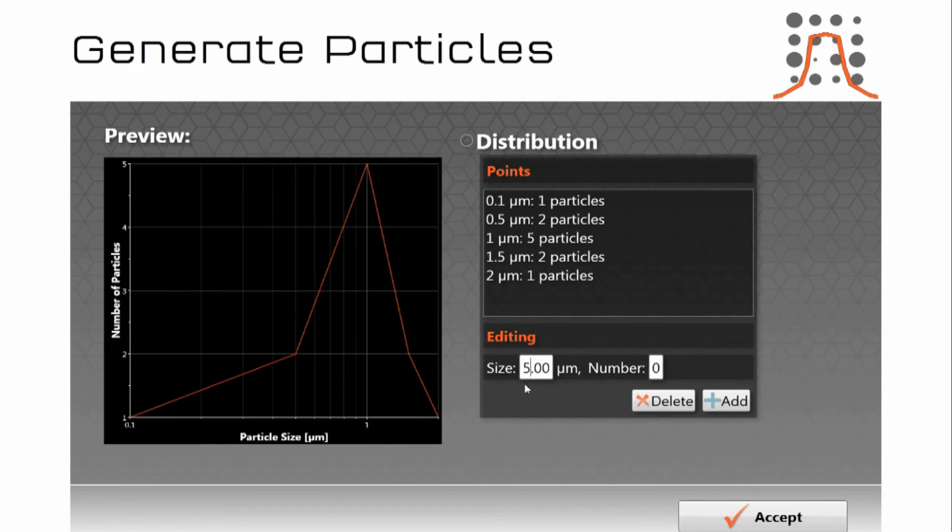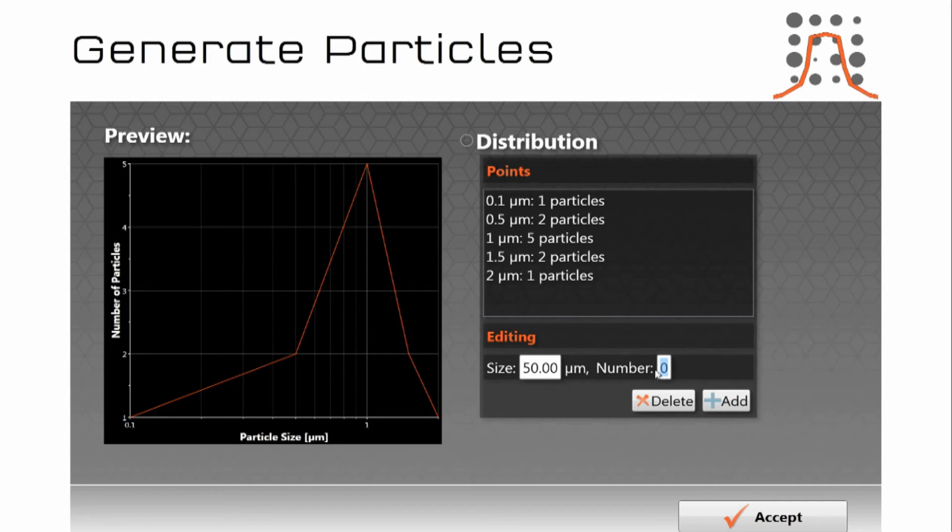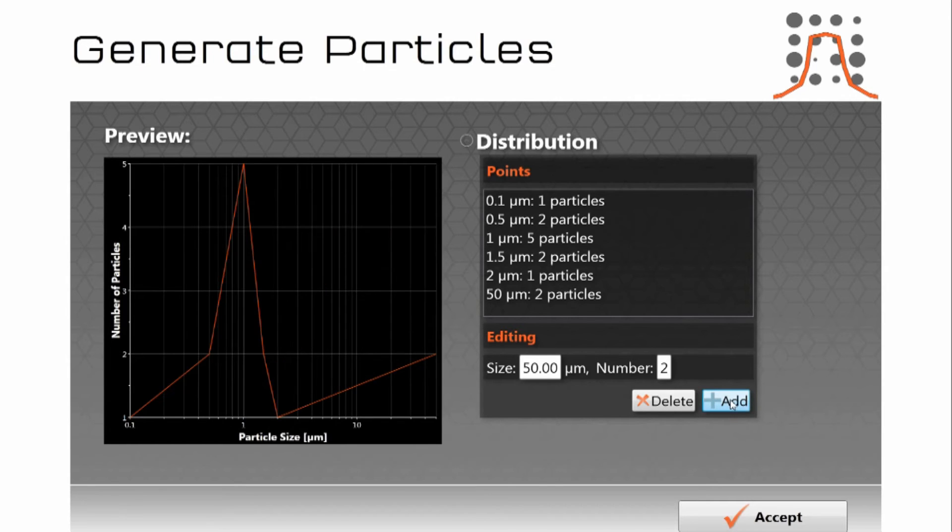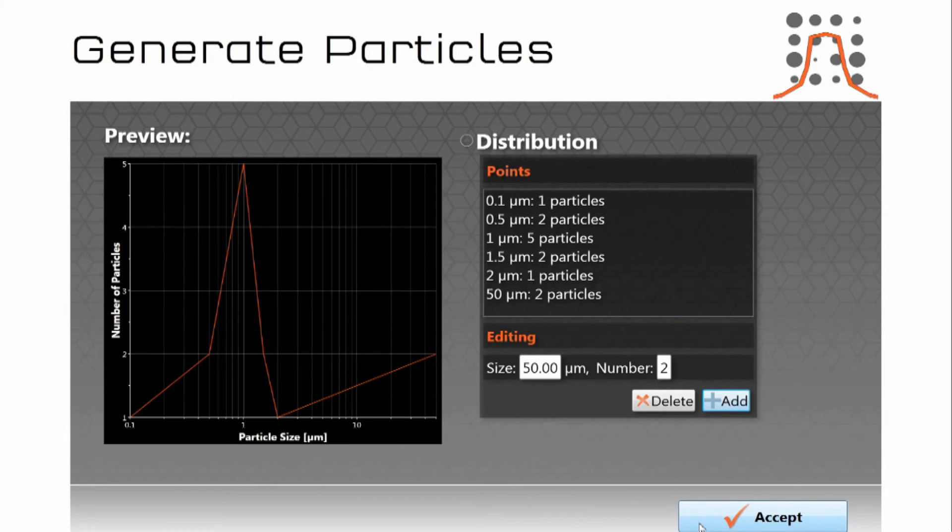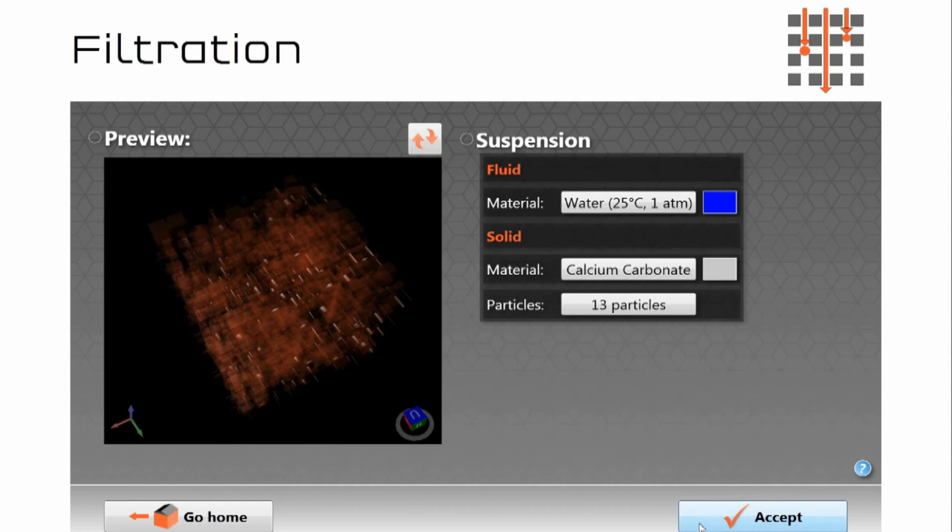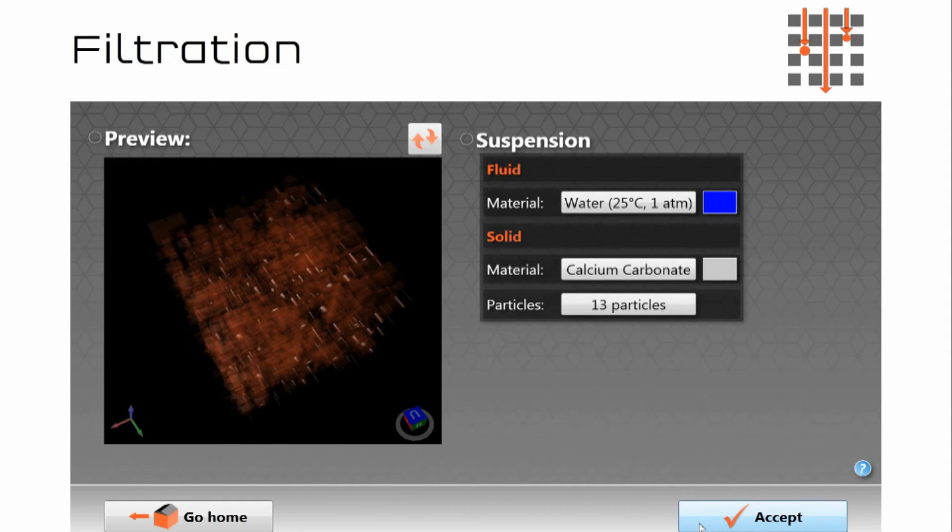I'm going to add a couple of 50 micron particles in to the distribution and add them to the overall distribution. So there we see the distribution has been added. We accept that as the particle size distribution we want filtered. We accept and watch the software filter it.